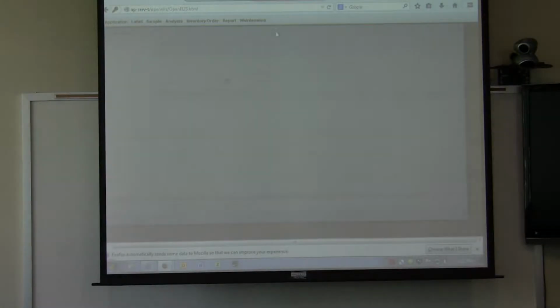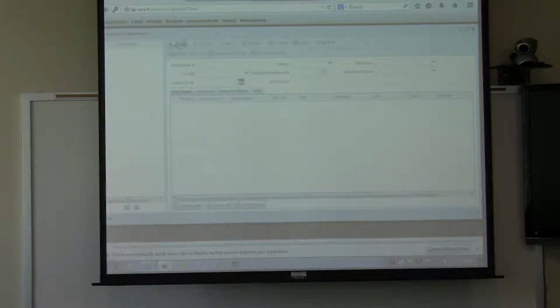So let me go through here, standard query. As normal, you just click query. If you happen to know a worksheet number, or if you know, hey, it's my stuff that's still in working status. We've got multi-select on the status, so you can pick multiple selections. You can say, all working and done's. You can go by create date, or if you remember from our worksheet builder discussion, you could put in your custom description. So if you remember what description you put on your worksheet, you can use that for your query.